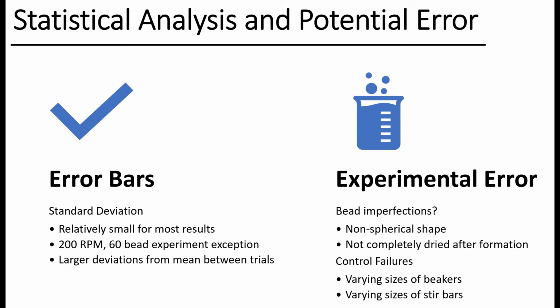The correlation between the n value of 0.43 and the diffusion model is made under the assumption that the delivery vessel is a spherical polymer. Our beads may have been oddly shaped and deviated from a perfect sphere. We dropped our beads from the syringe high above the solution rather than within it. This may have led to defects.